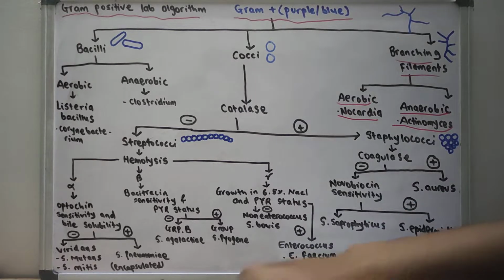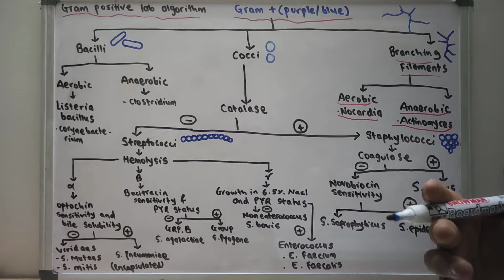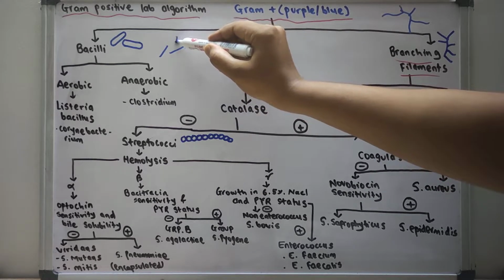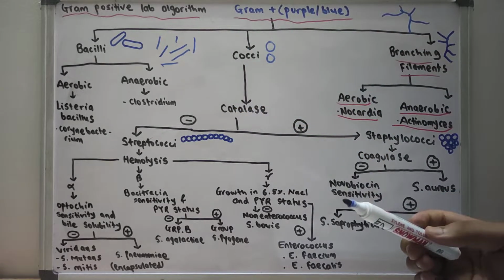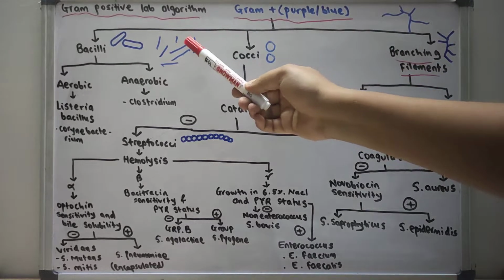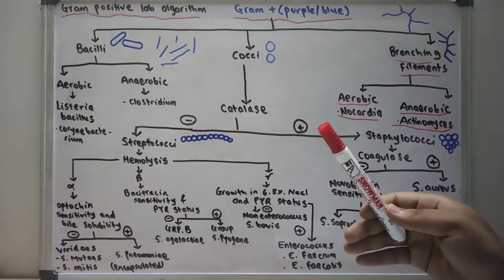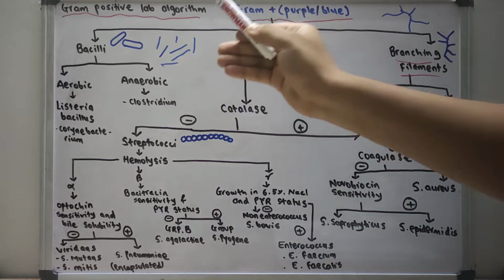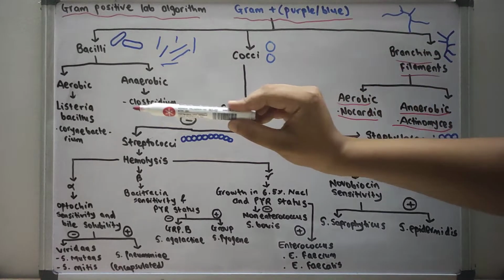Now another type of bacteria you see is the rod type of bacteria. So after the gram stain and on the microscope you see the rod like structure like this. So after seeing the rod like structure, you immediately identify the structure as bacilli. So it is purple color and you see the rod like structure and you identify it as the gram positive bacilli.